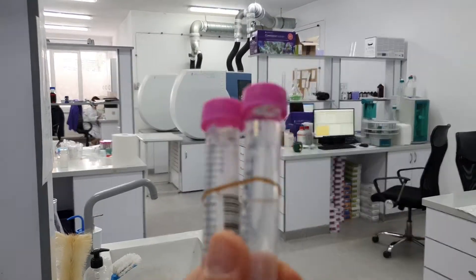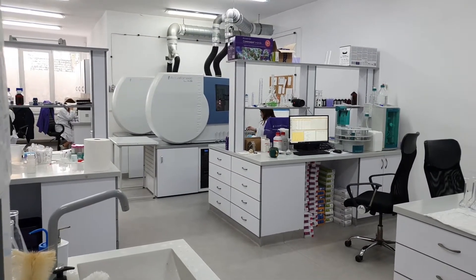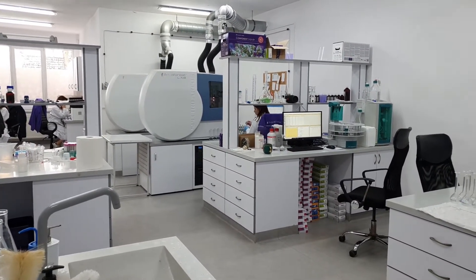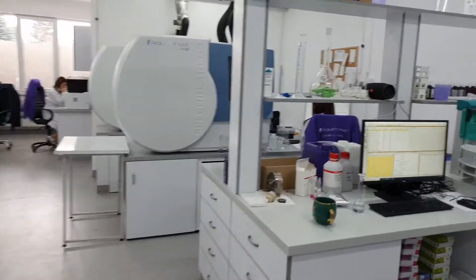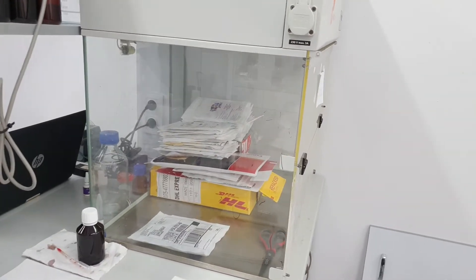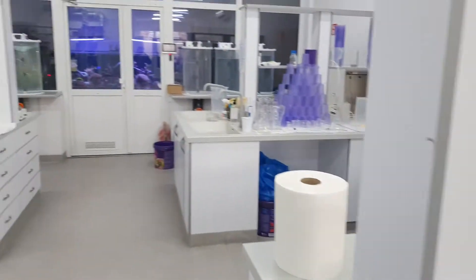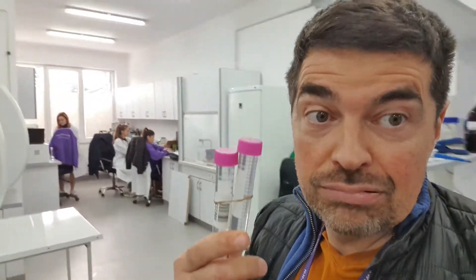The samples we have here for macro elements need to be diluted 100 times to be accurate. When samples arrive here, they are treated as contaminated. They stay here for 24 hours, waiting for their turn. That's why we always say that samples need to wait. That's about the samples that we normally handle as part of ICP testing.